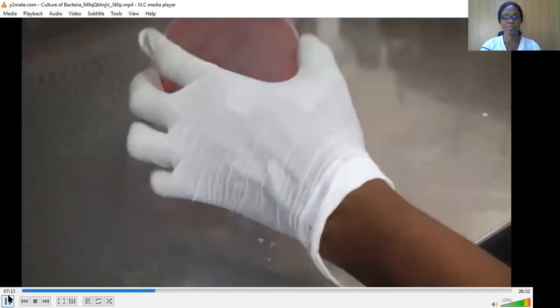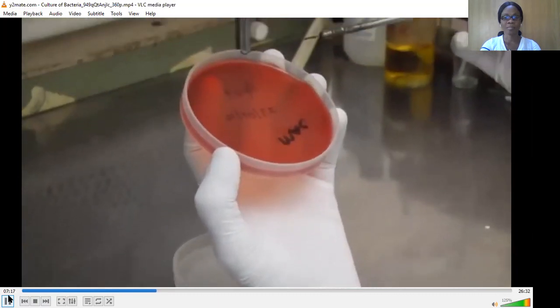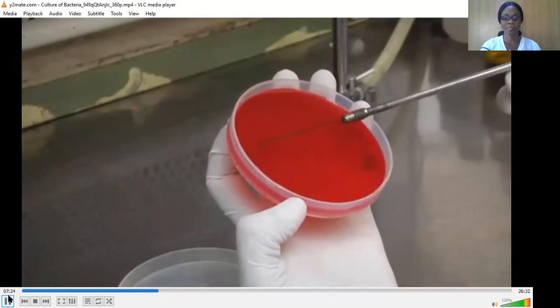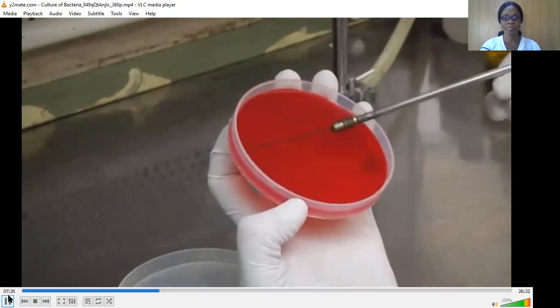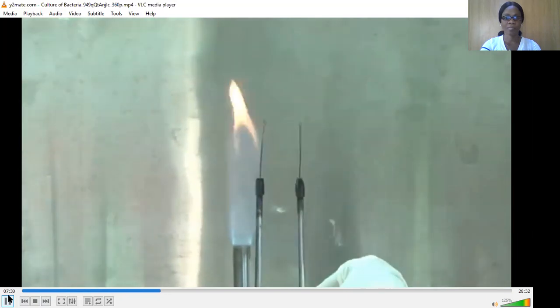Lift the base of the plate containing the medium in your left hand and hold it using your thumb and middle finger. Spread the inoculum thoroughly over area A. This is called the well inoculum. Re-sterilize the loop and let it cool down.